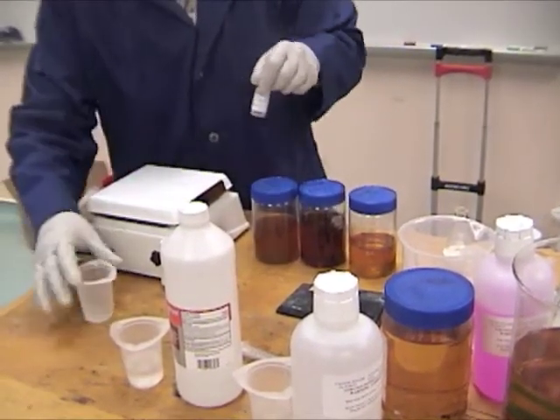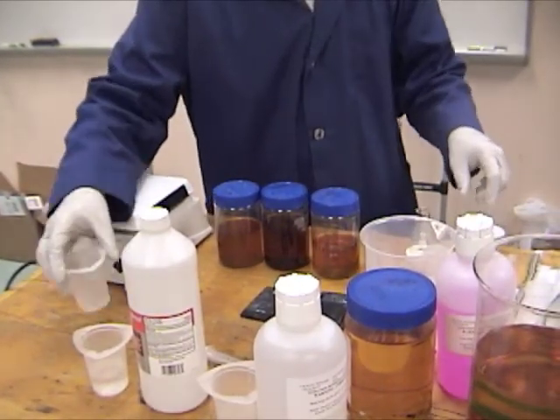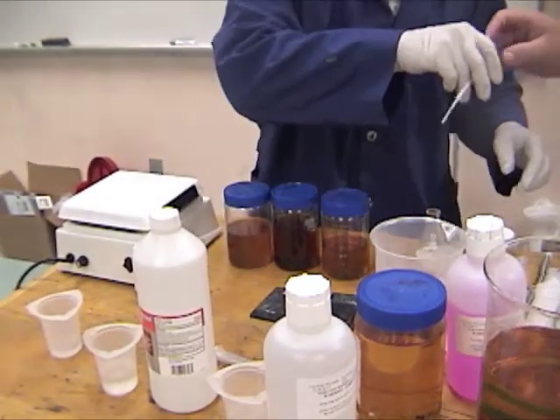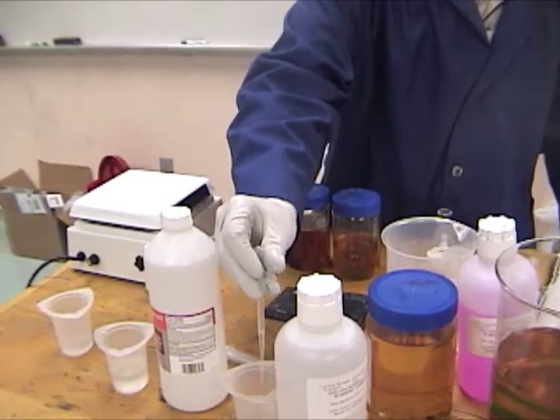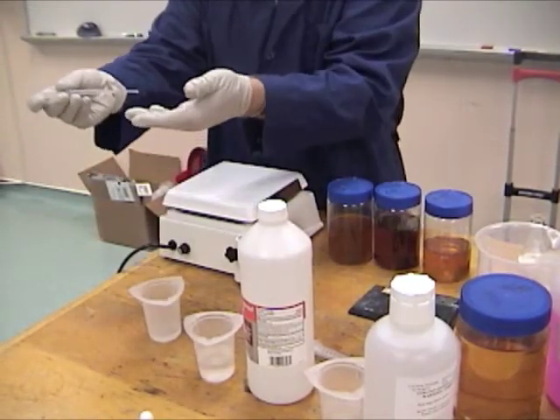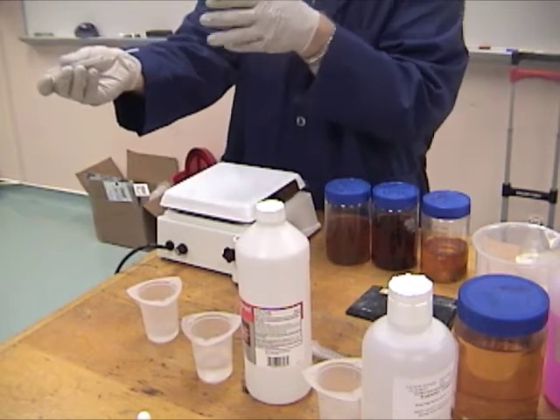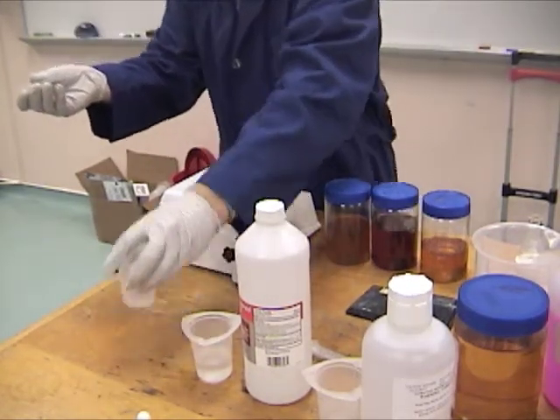This didn't turn. And so you put a little bit of base in there, don't you? You could just go ahead and use your pipette. Mine usually takes 3 or 4 drops to turn. So what I'm doing is I'm just going to drop in measured amounts of this titration solution into here until it just turns and then it'll turn back. That tells me I've neutralized it, and I'll hold this up.